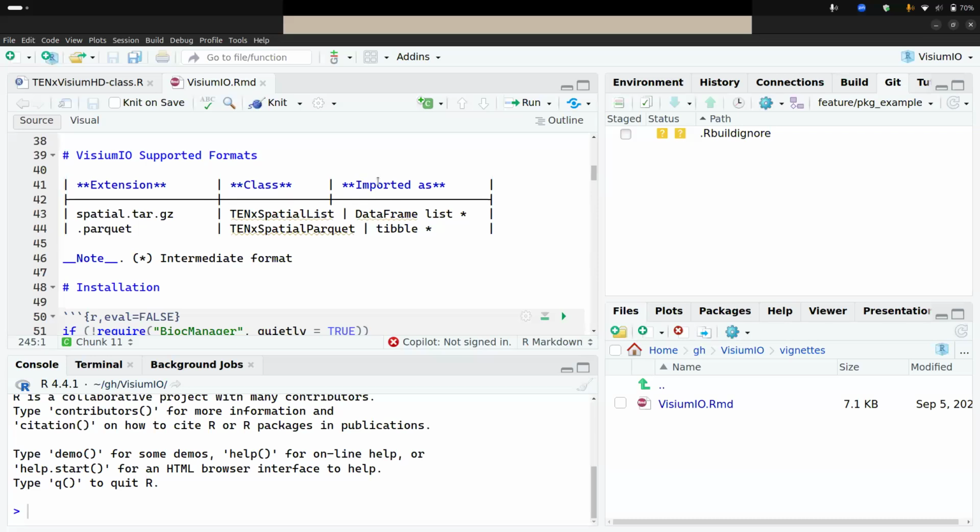That's typically what you get when you're running the pipelines, like the Cell Ranger and Space Ranger pipelines. Mainly your input would be a path to a folder. These are how things are working in the background. They're running a constructor function and generating a spatial experiment, in this case using the VisiumIO infrastructure.